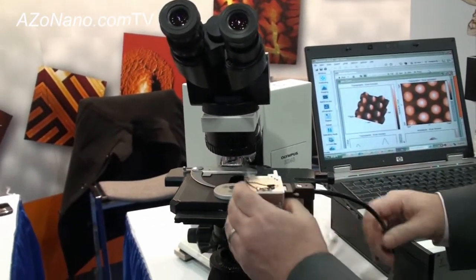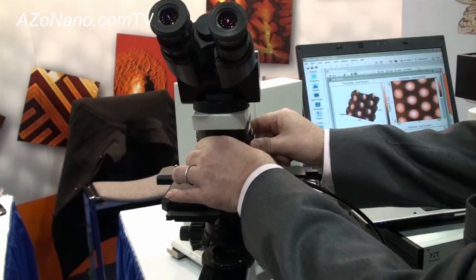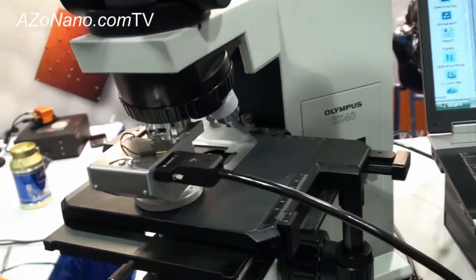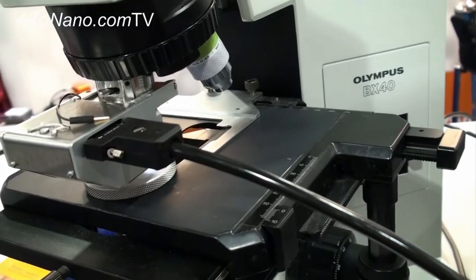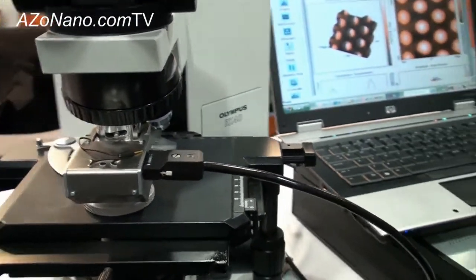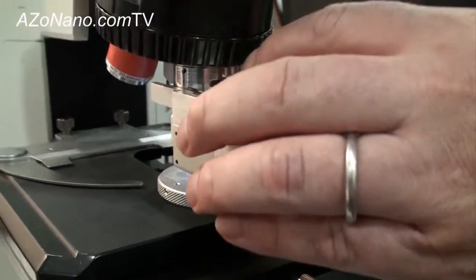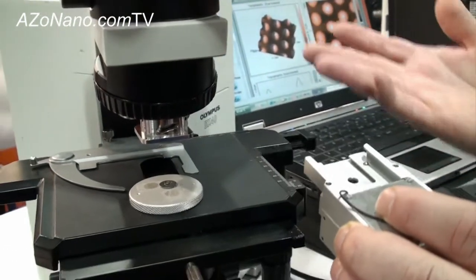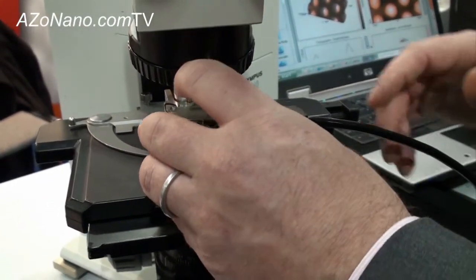This system adapts easily to a standard optical microscope so that you can switch between AFM and optical capabilities. The AFM fits nicely into one of the turrets on the microscope, and we have turret adapters for all of the standard objective sizes — Nikon, Olympus, Zeiss — any of the different objective sizes, we would be able to have an adapter for that system. The system just easily slides in and out for any instance where you might want to change the cantilever or have access to some other capability.